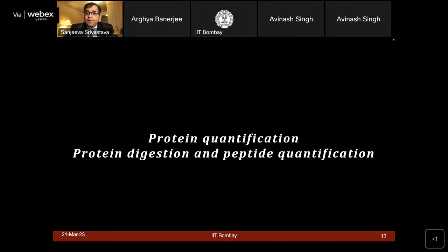In our first direct live session from the lab, we are going to show you the protein quantification. Once you know that you got 100 microgram protein or more, and you want to digest 50 microgram protein to get sufficient peptides, then you have to do the peptide quantification and also ensure that you got a sufficient amount of peptides from the given sample. So these are the things which we do. Let me introduce here the TAs who are going to take this session, and they will walk you through the steps briefly for protein quantification and peptide quantification. So Avinash, Ankit, and TAs, over to you.